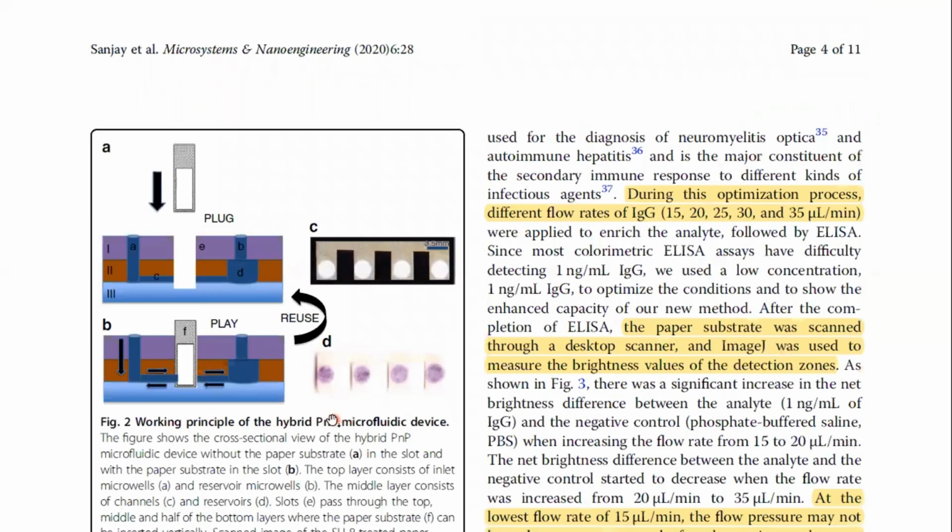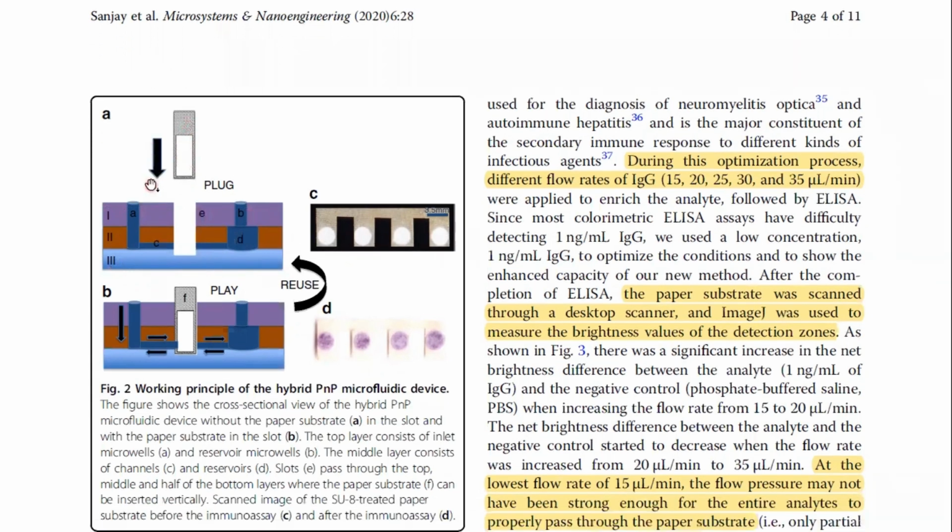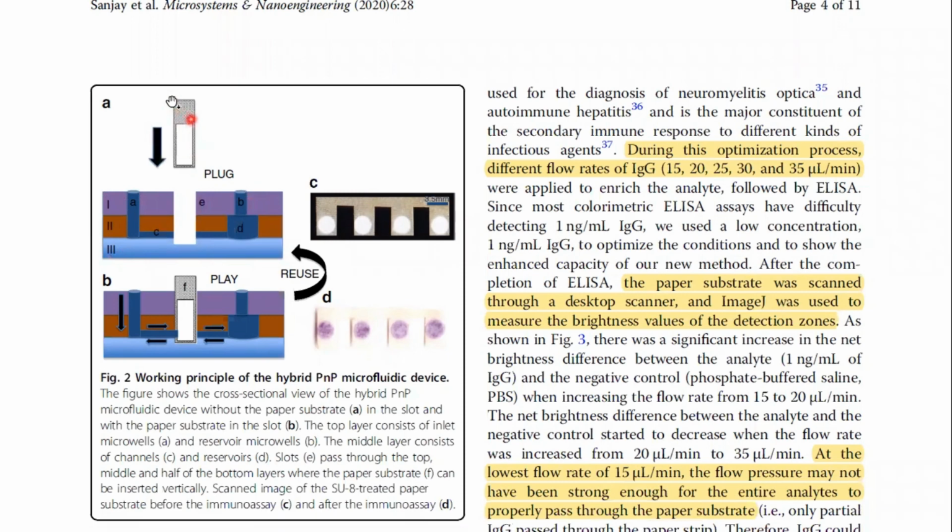Here is the working principle of this hybrid plug and play microfluidic device. Here we have the first layer, the top layer, where the inlets and the outlets of the reservoir are located. Here we have the middle layer, where the microchannels and the reservoirs are located. And the third, or bottom, layer offers support for the location of the paper substrate. That is where this colorimetric assay is going to happen.